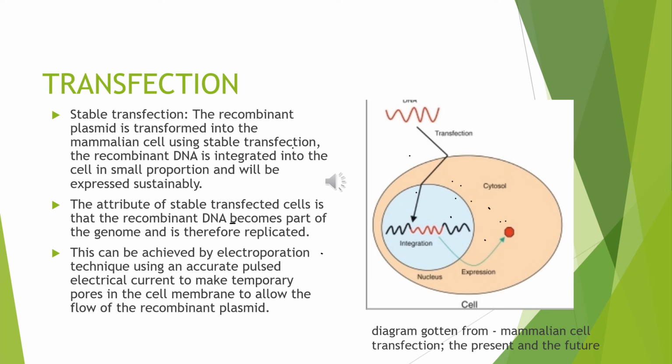After placing the vector into a mammalian cell, the transfected cells will be grown in a medium at low cell density containing G418 antibiotic. After putting the transfected cells into antibiotics, the transfected cells that contain the plasmid will grow and form colonies, which will validate successful insertion.